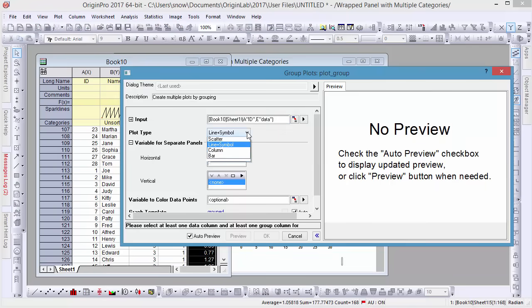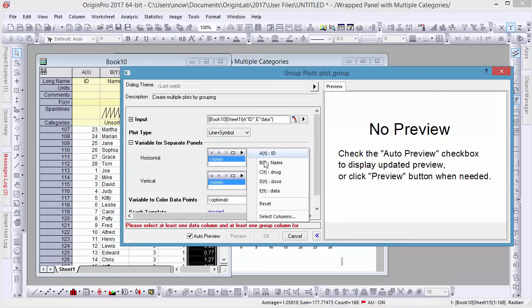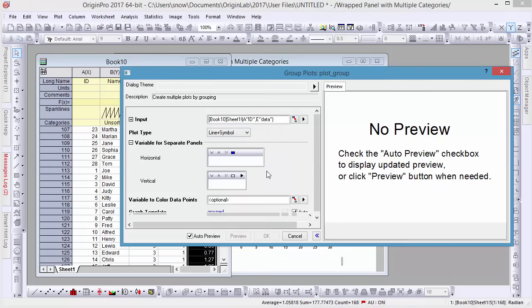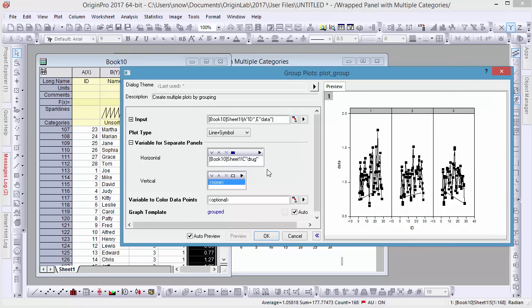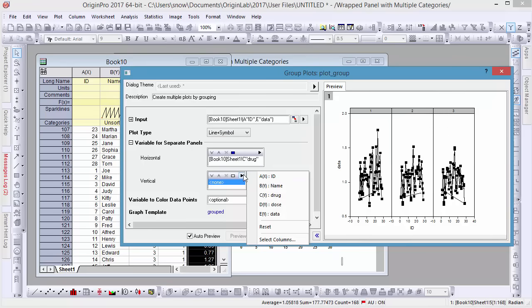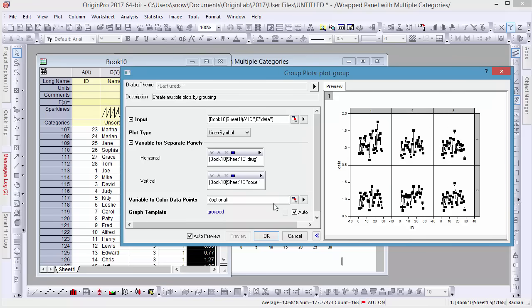Next, let's specify the plot type. Here we'll use line and symbol. Set the drug column for the horizontal panel variable and dose for vertical panels. The preview window will update to show these changes.